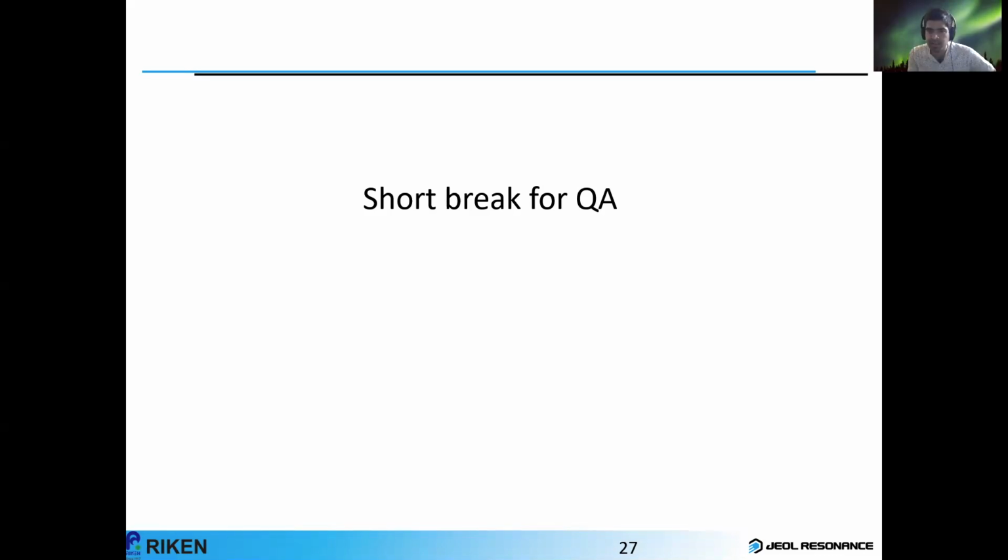All right. So the next question is from Ulrich. How difficult is it to spin paramagnetic samples, and what is the related sample heating? Okay, for a paramagnetic sample, if it is just paramagnetic, nothing difficult. Just put the sample and spin it in the magnetic field. Then the sample heating in the case of a paramagnetic sample solely comes from friction between the air and the surface of the sample rotor. Typically this friction scales with the power of 2.5 of the spinning frequency.